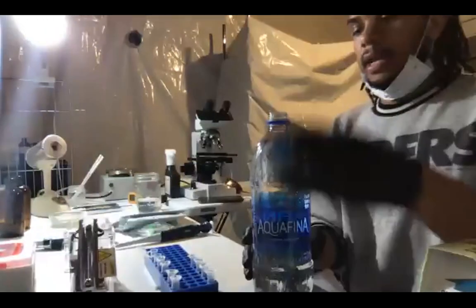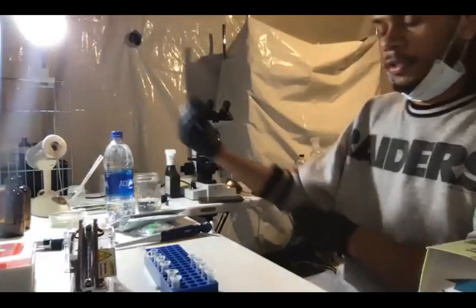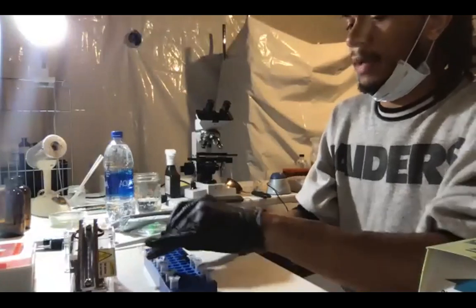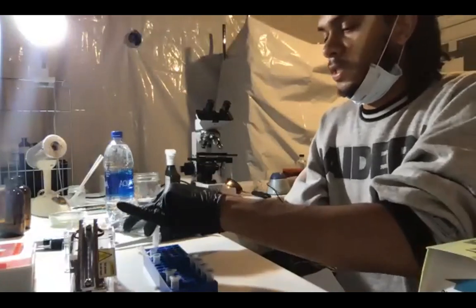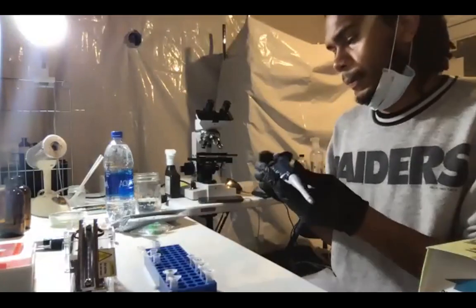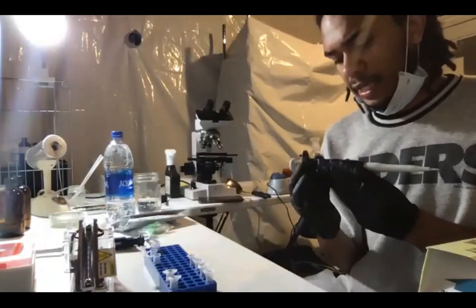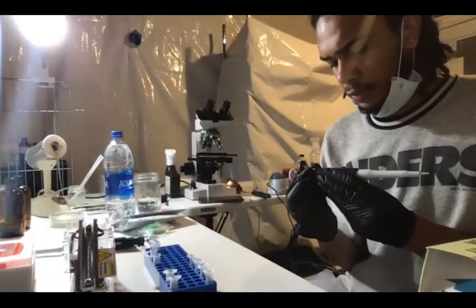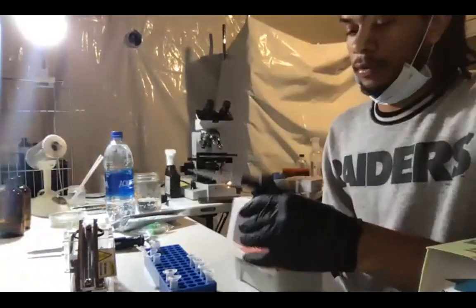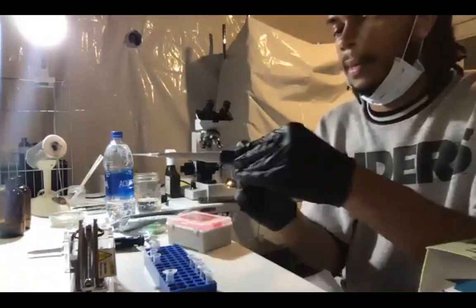And now I'm gonna add 8 forward and 8 reverse into each of those. But at this point, you need to make sure that you're only putting the MAT1 primers with the MAT1 tube and only the MAT2 primers with the MAT2 tube. You don't wanna mix MAT2 primers with the MAT1 primers. And I'm doing 8 of each. It's okay to mix the MAT1 primers with each other, the forward and reverse. That's what you need to do. Do not mix the MAT2 primers with your MAT1 primers.